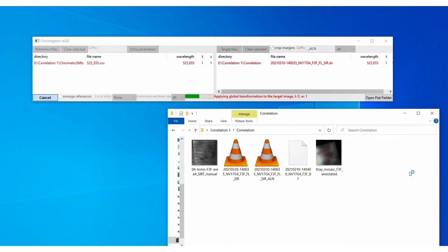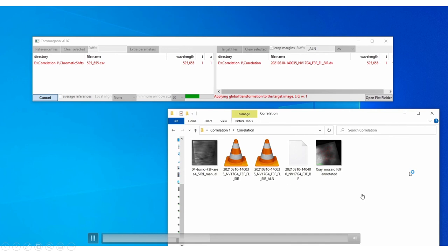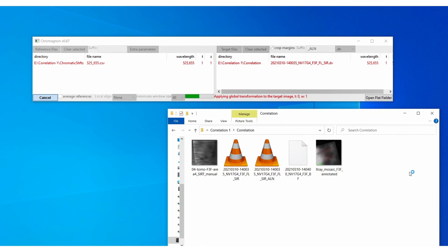You can see it generates a new file with the underscore ALN.